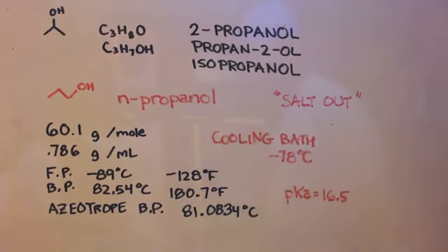It's great for cooling baths. It's cheap like acetone. You can see the freezing point is minus 89, and dry ice sublimates at minus 78, so it won't freeze. So basically, any organic solvent that won't freeze does the same thing. Like acetone would be good.